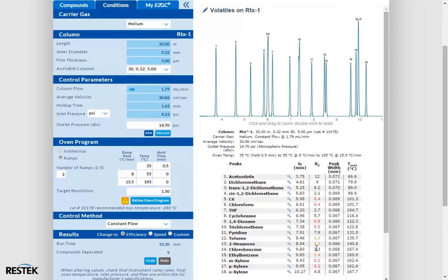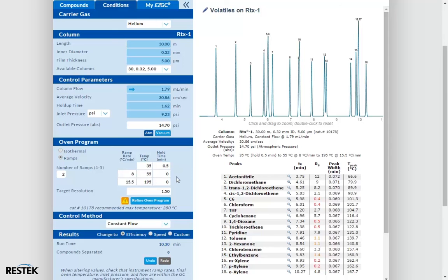The reason is that although the flow rate has changed and the model did update, no changes were made to the oven program by the software. By changing our flow, but not updating our oven program, we changed the elution temperatures of our compounds of interest. In order to get the same optimized separation for the new flow rate, we would need to translate the oven program for our new flow rate. We can do this with ResTech's method translator, but before we do that, let's try something a little easier.